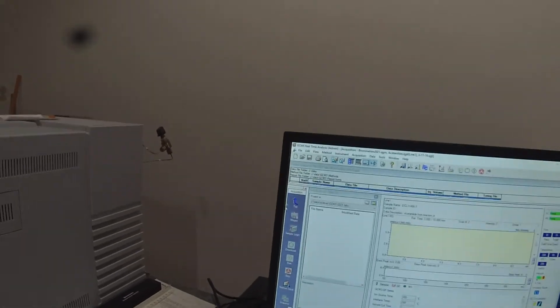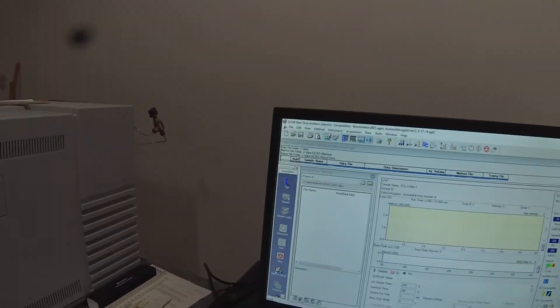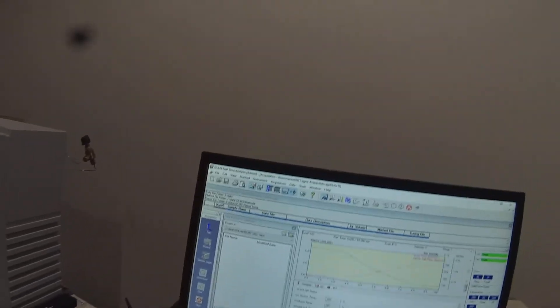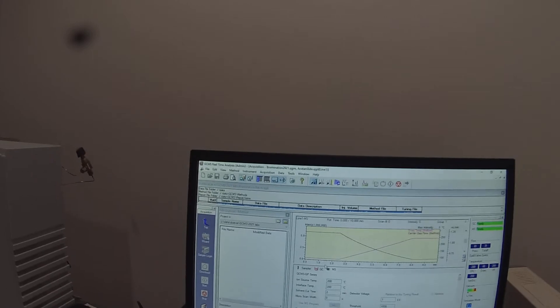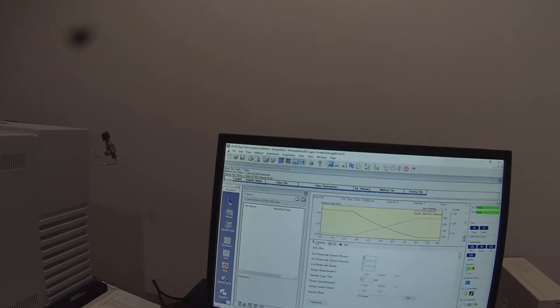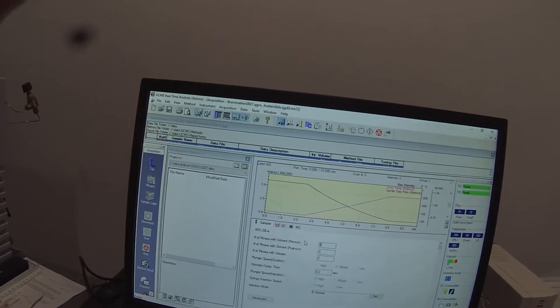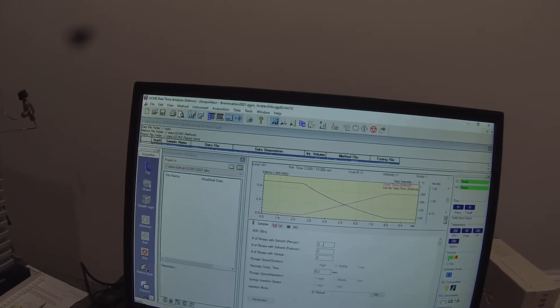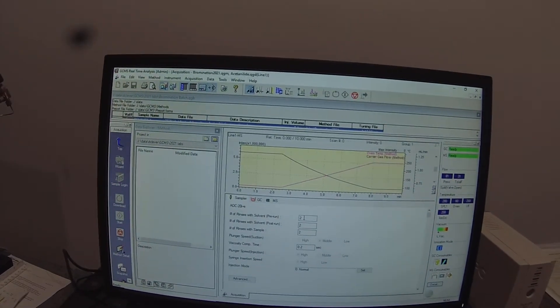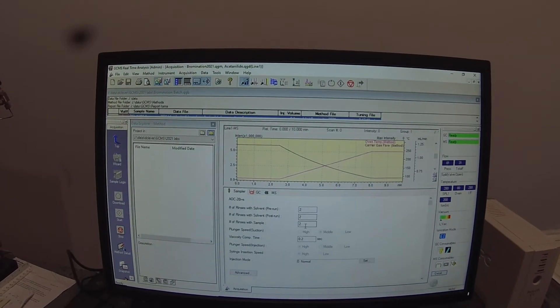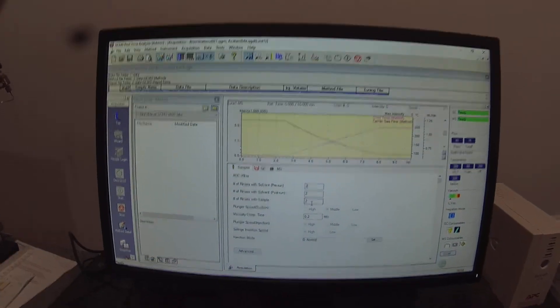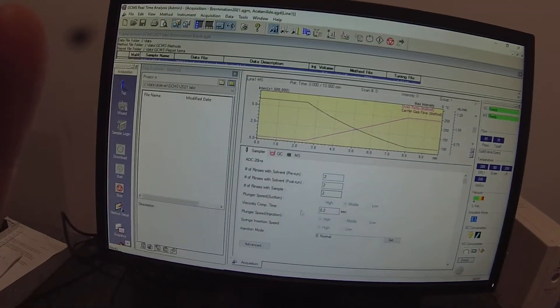And let's take a look at our method detail. And you can see that we have that sampler set to wash twice with solvent before the run and twice after the run and twice with the sample. So we're being very consistent.